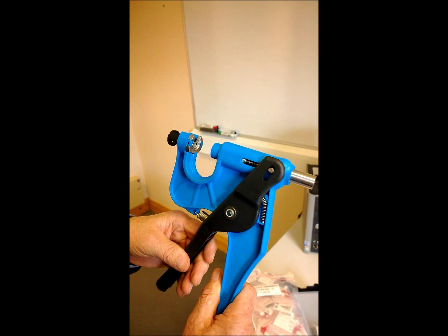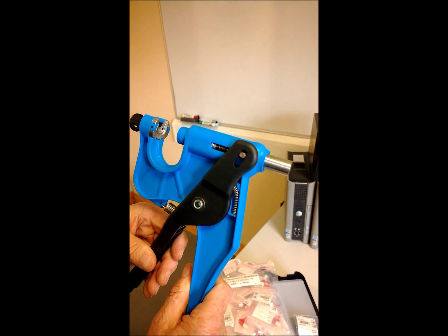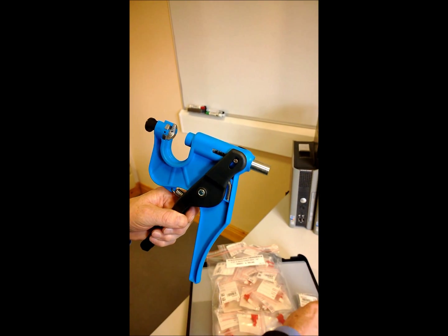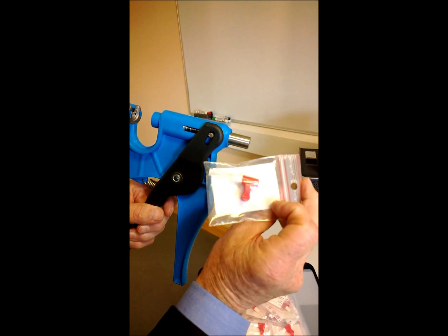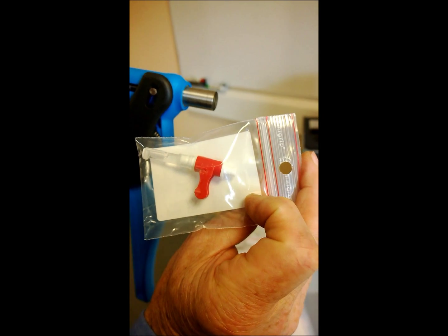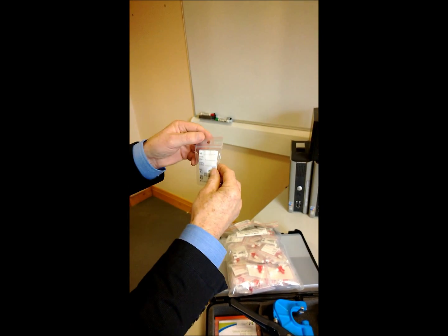It simply uses the tube to remove a tiny 3 millimetre sample of tissue from the ear of the animal and deposits that sample into the tube that contains the preservative liquid.